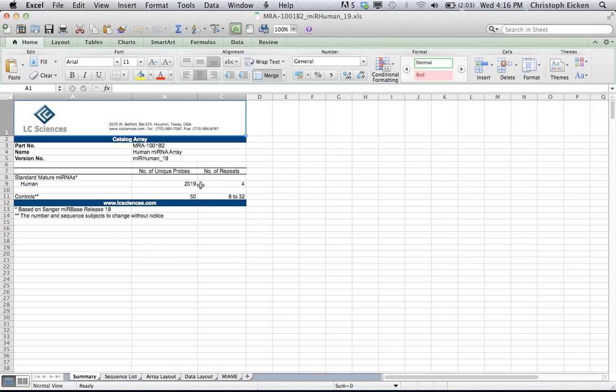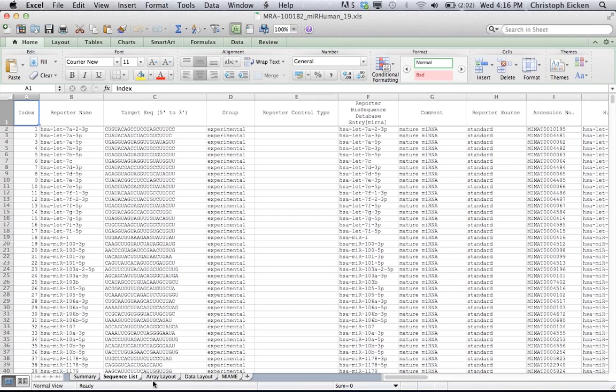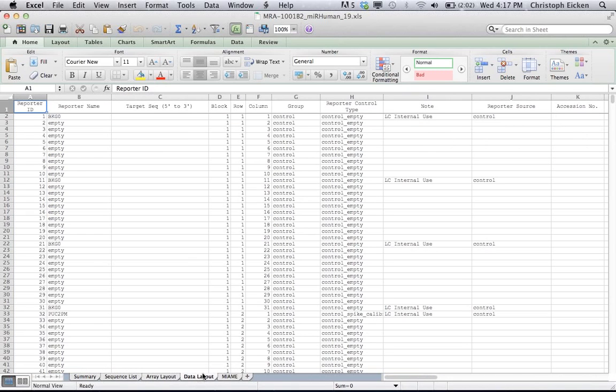If you look at the file, this is the first page, it shows you exactly the number of unique probes, number of repeats. And if you go down to the tabs, it lists exactly the sequences that were used based on miRBase, the naming, etc. This is the actual layout on the chip, so it really defines which cell included which probe.